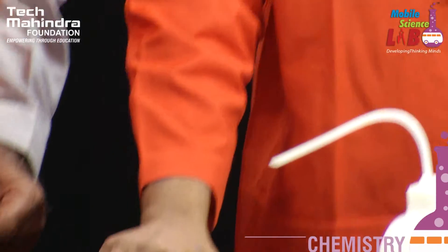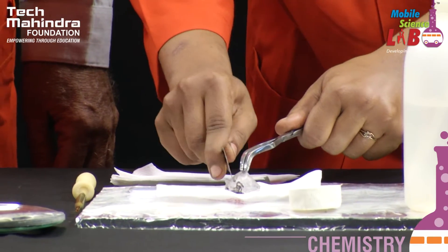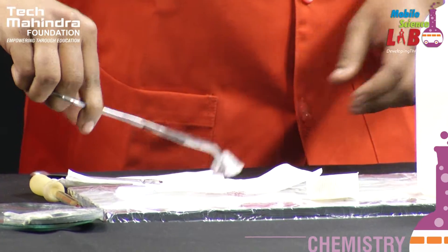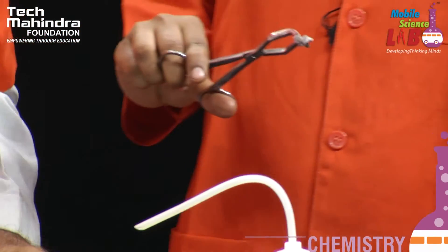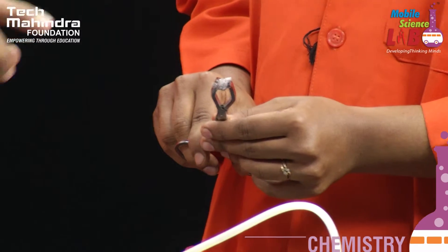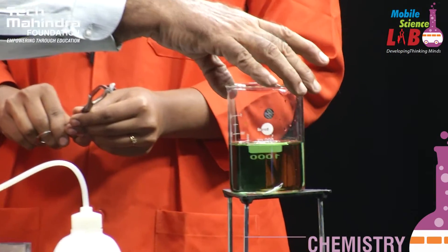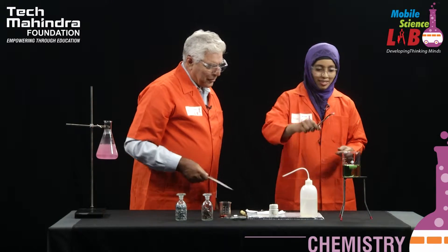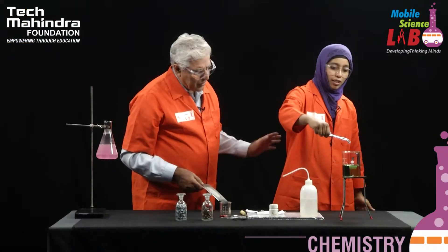Now I would request you to cut a smaller piece — that should do — and please put away the remaining piece inside. Pick it up — very soft and shiny metal, but as you told us it will get dull after some time. Now I want you to add it into this. Viewers, watch carefully what happens. I am going to put the sodium metal in water in which we have already put some indicator — that's why we have some green colour over here.